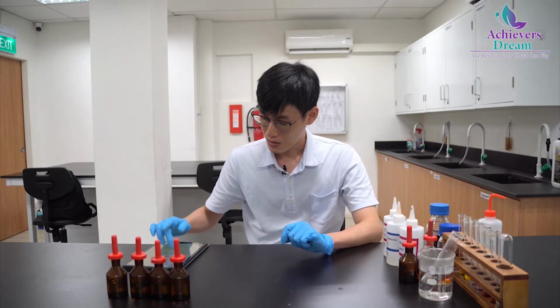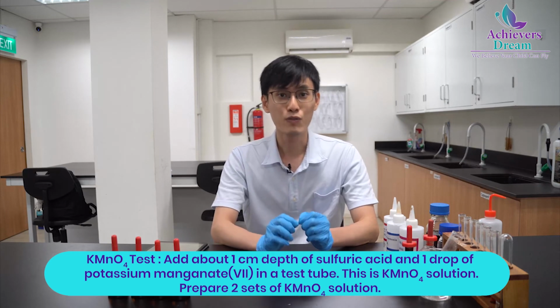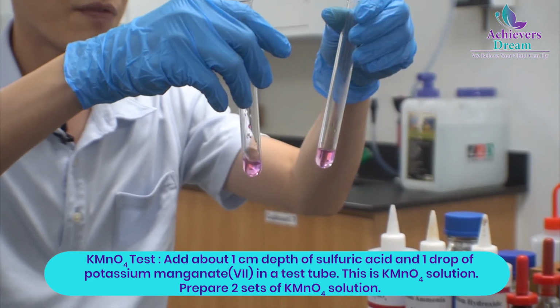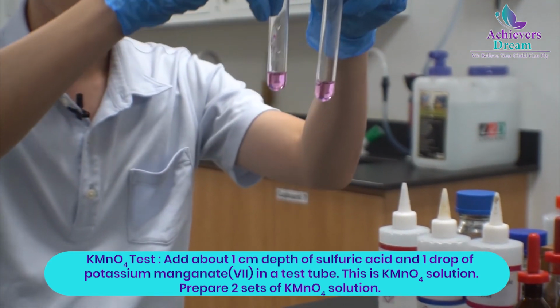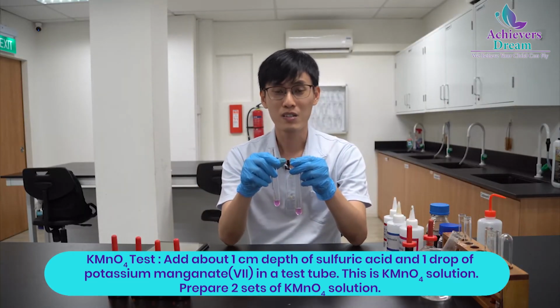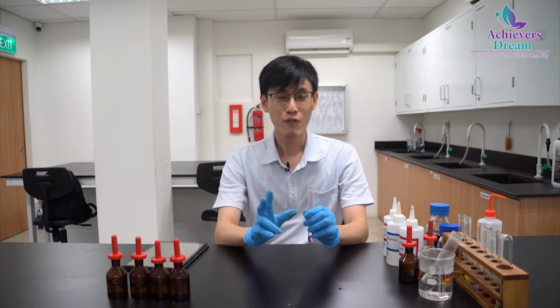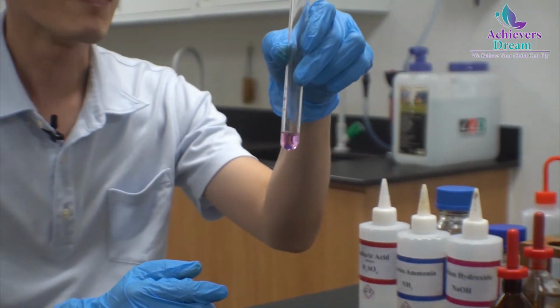So while waiting, we'll be moving on to the next test in part C, which is the KMnO4 test. So here I have with me 2 test tubes that contain sulfuric acid filled with 1 drop of acidified KMnO4. Notice the pale pink color of the solution. When you are doing this test, you do not want the solution's color to be too intense, because that will take a bit more reagent for the KMnO4 to decolorize. Just pale pink like this will be very good.